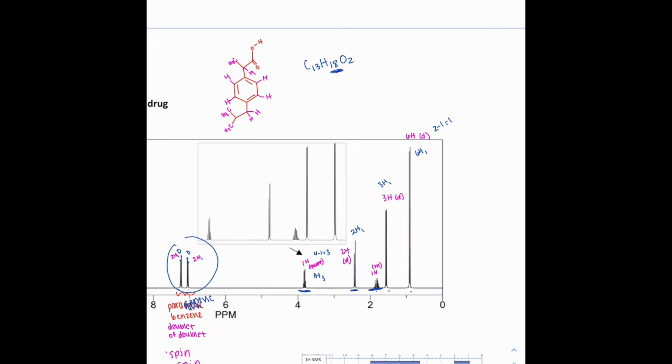We just want to keep that in mind. Another thing I want to say is, while the benzene is right in the middle there, it is more electronegative, just because that benzene does have those carbon double bonds, which does create more electronegativity.